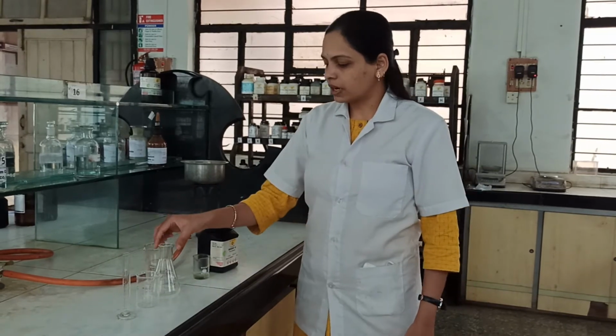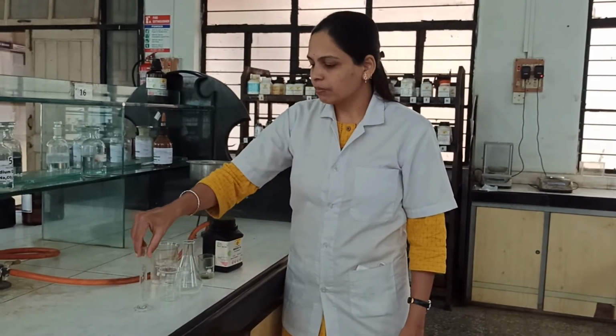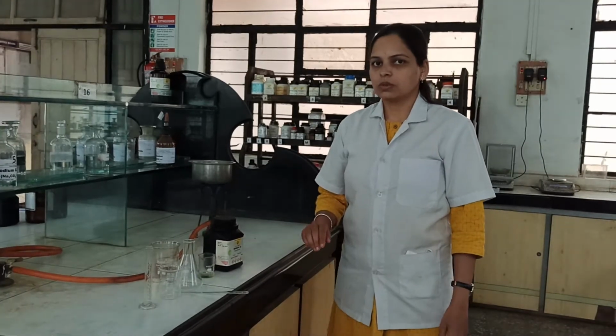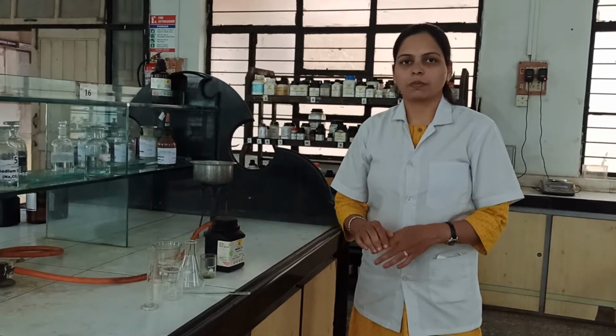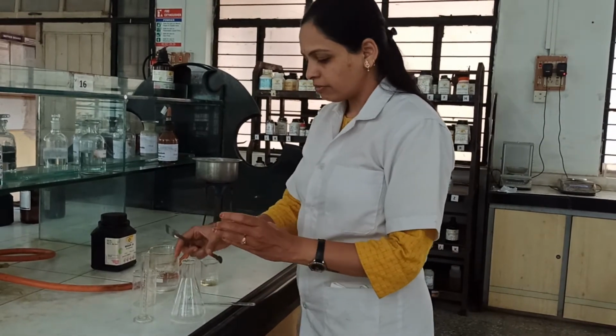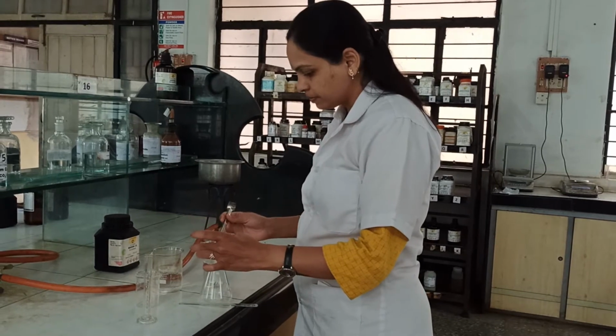Along with this, we will require glassware, that is a conical flask, beaker, measuring cylinder as well as glass rod. Now, let us start our synthesis. Students, now we will transfer 2.5 gram of benzoin into a conical flask.